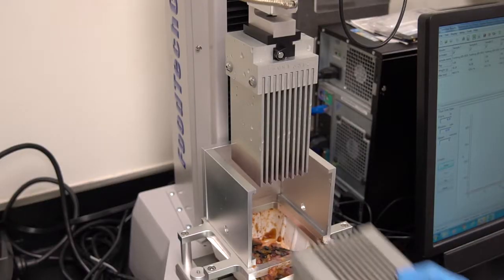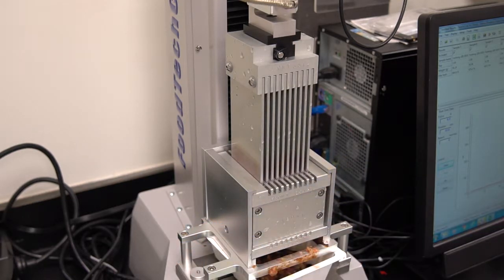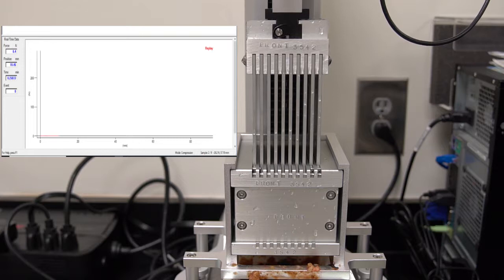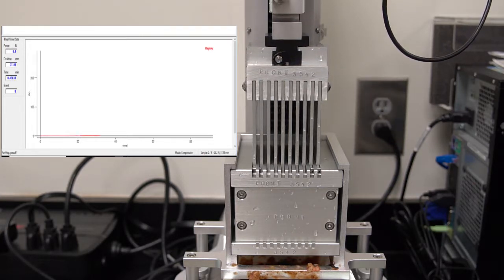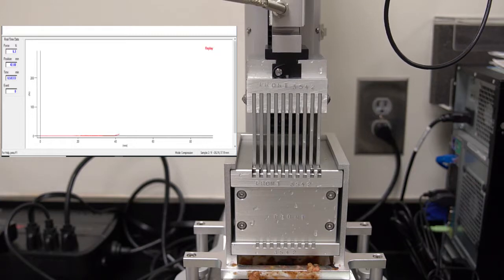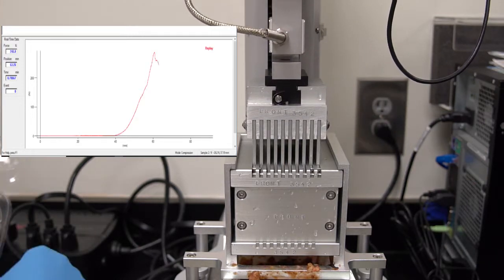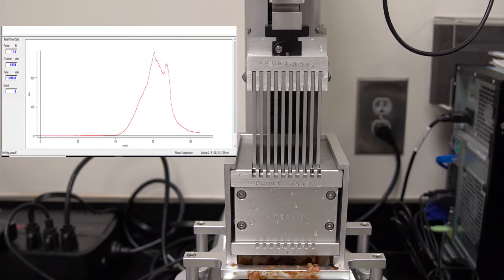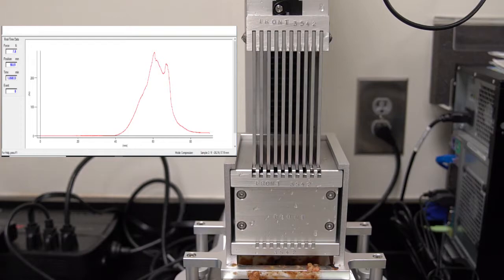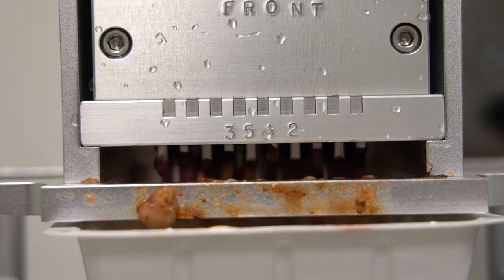Kramer-Shear not only provides information about fruit firmness, but is a composite measurement of shear, extrusion, and compression forces. It also is a good indicator of crispiness, something that is highly sought after by consumers. The maximum force or max load that is required for the shears to completely compress the berry sample is recorded. Soft berries usually have a relatively low maximum force reading. The berry matrix is ultimately extruded through the bottom of the compression cell.